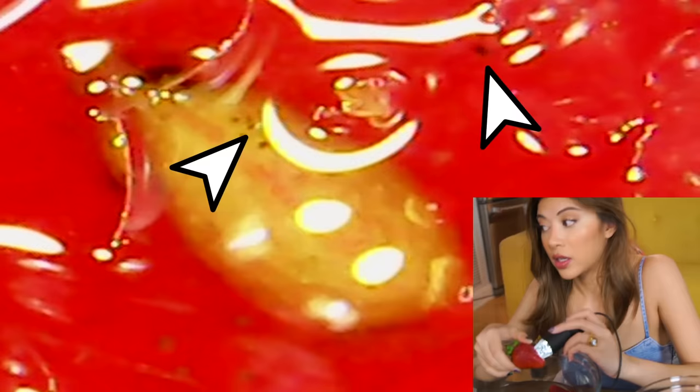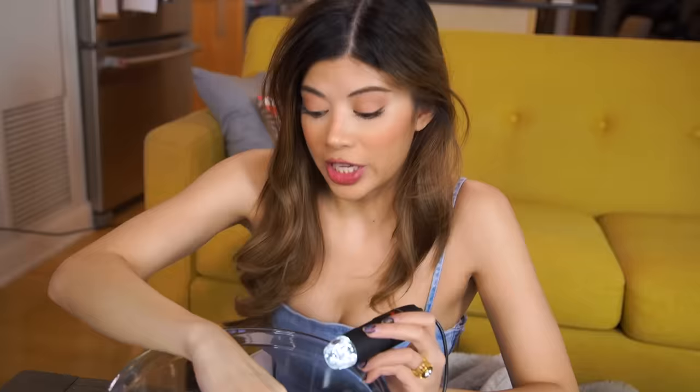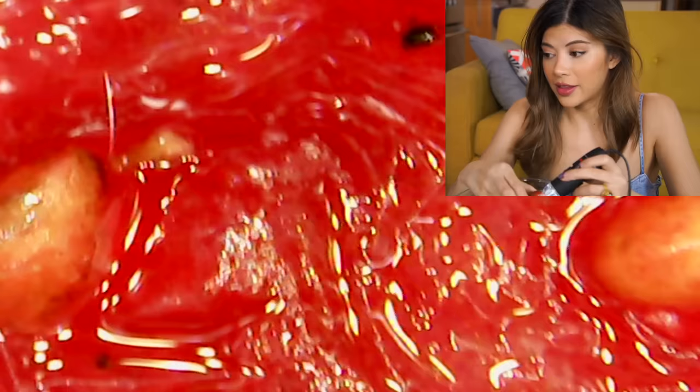That looks like a beetle but I think it's just a seed. There's something living on here — that little black dot in the top right corner, that thing is alive. There's a white thing moving. My hands feel itchy right now because I'm so distraught. These are things you can't see with the naked eye. I'm certain the one I saw at first — it darted across the microscope. I'm so disturbed. You should never look at something this close. It's disgusting and terrifying. I think we've concluded that this particular mixture really works, but some of the other mixtures drew out more, so I think we move on to those.